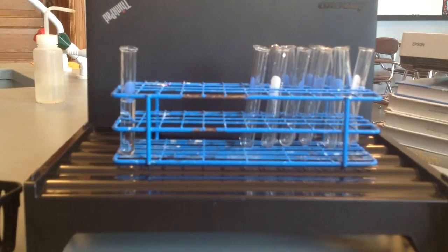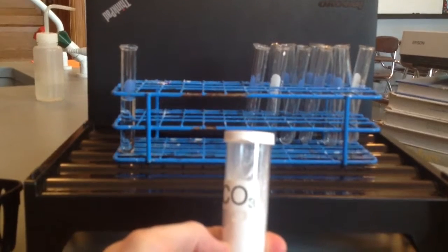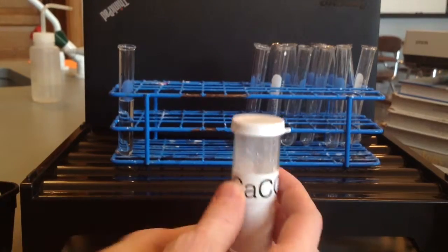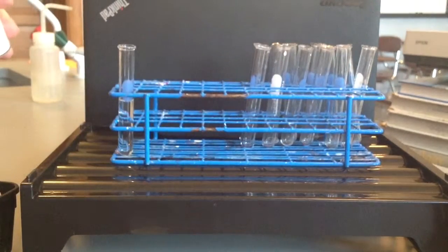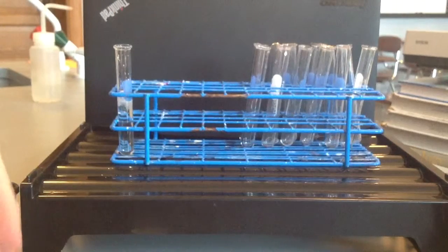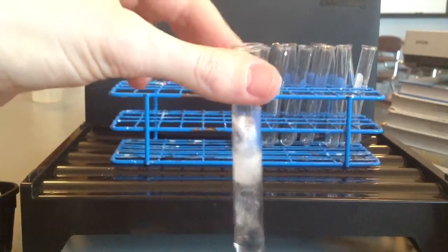And then the next part is we're going to add our calcium carbonate, which is in this little plastic vial here. Let me focus in on it real quick. So there is our calcium carbonate. I'm going to add a small amount, about pea-sized amount, to the sulfuric acid in the test tube. I'm going to bring it a little closer to the camera so you can see what's going on and be able to make accurate observations. I'm going to stir it up a little bit, get that solid down there.